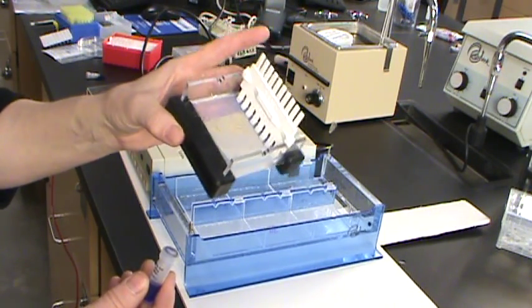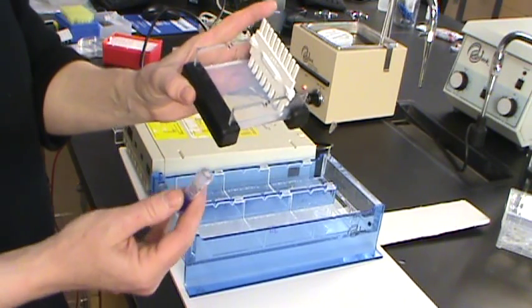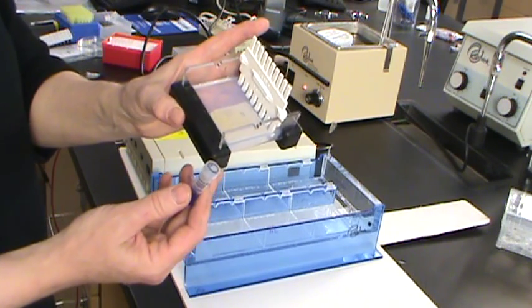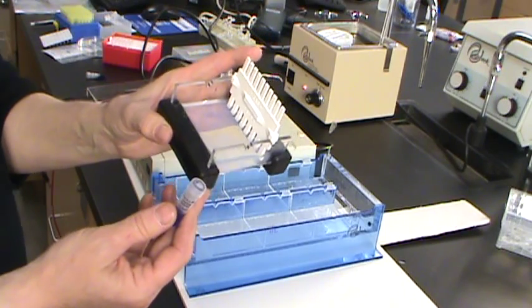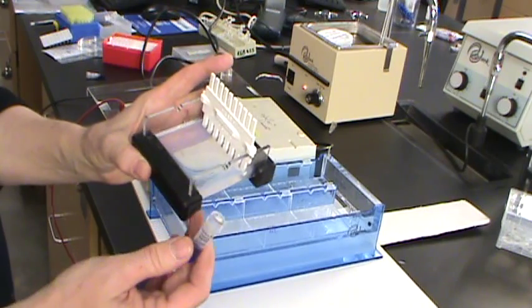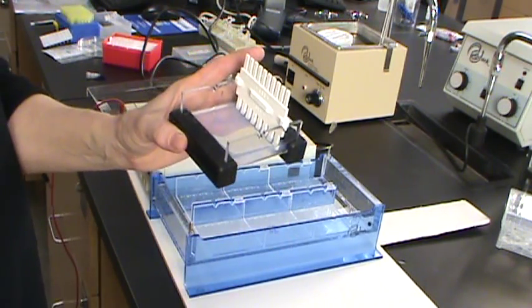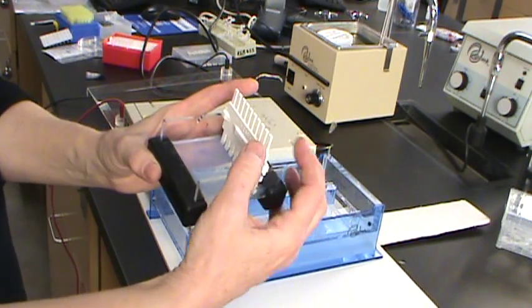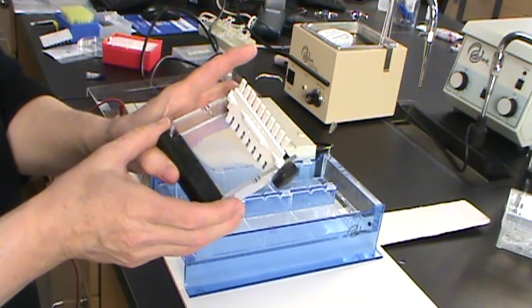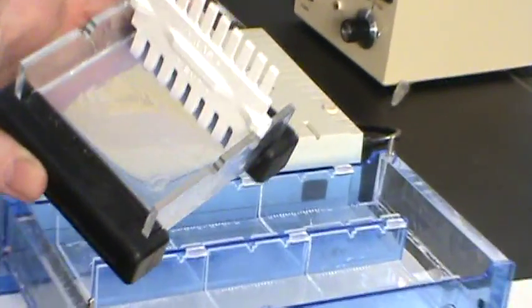For time's sake, we decided to make the gels for you. What happened was that we made a 0.8% agarose slurry in our electrophoresis buffer and poured it in these forms, these plastic forms that have these rubber dams on either side of them. And then while it was still liquid, we put this comb in. This comb makes it so we have 8 nice wells for doing our sample loading. And we can see that a little bit closer if you'd like.